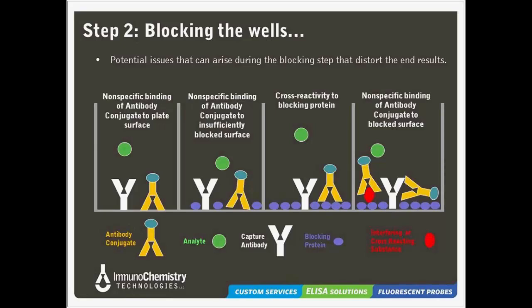Now, there are a couple other ways to have problems with running ELISAs, and the nonspecific binding issue is a huge one. Some people have this type of IgM form, and they're totally healthy, so I'm just telling you, but the IgM is a sticky carbohydrate, and it wants to stick to your blocked surface.